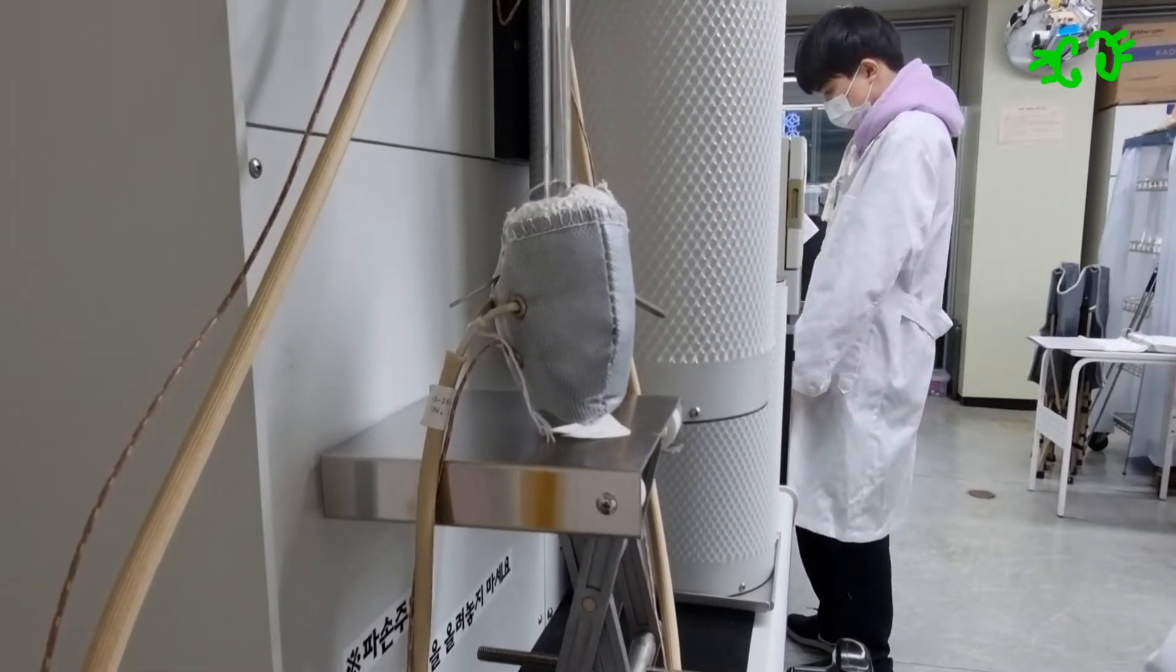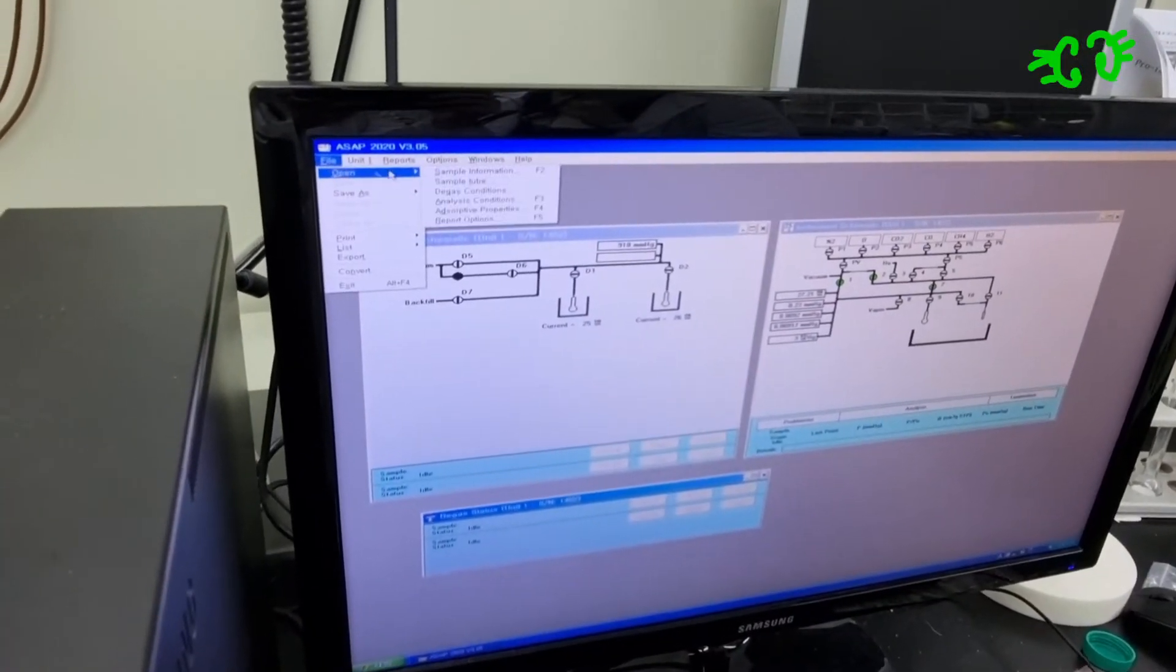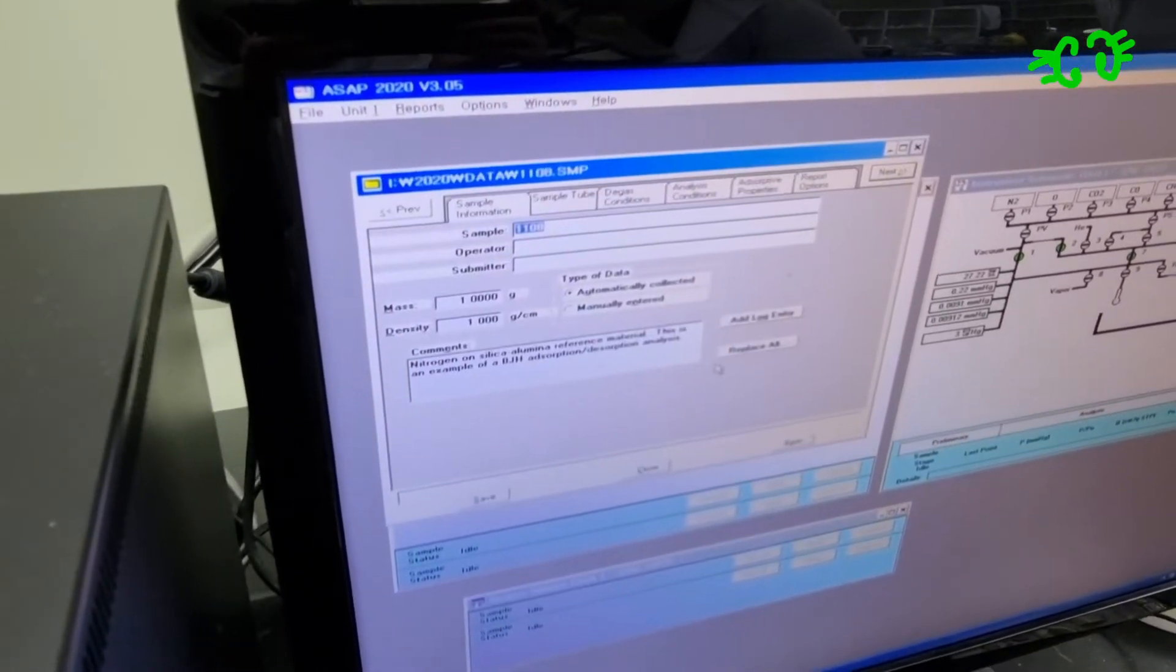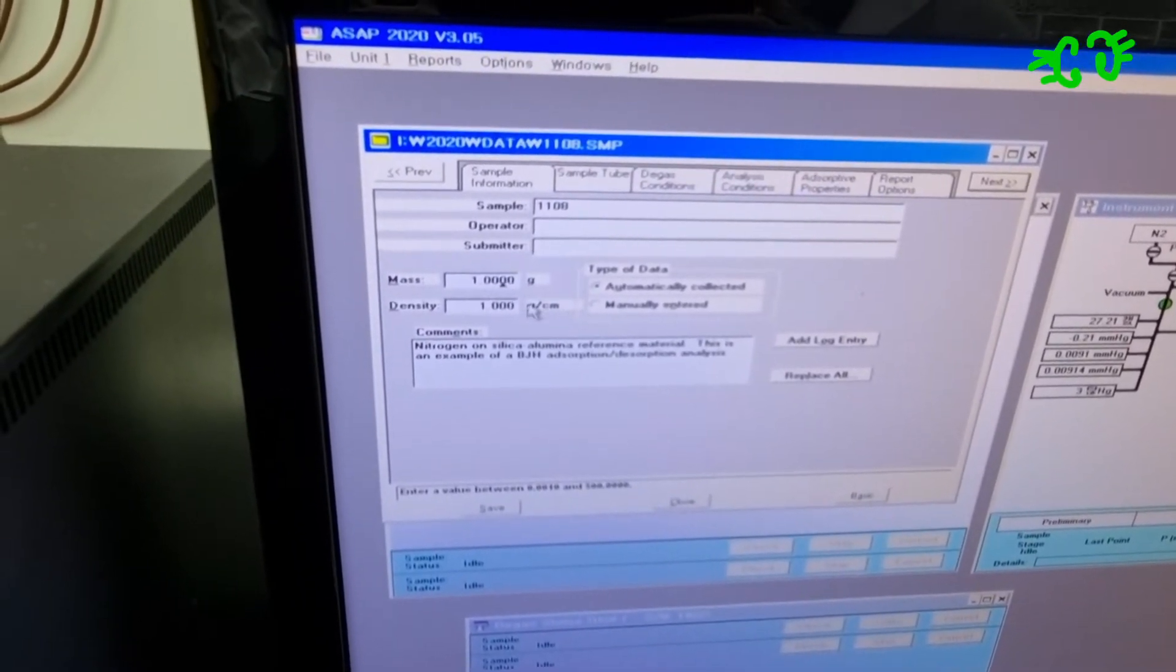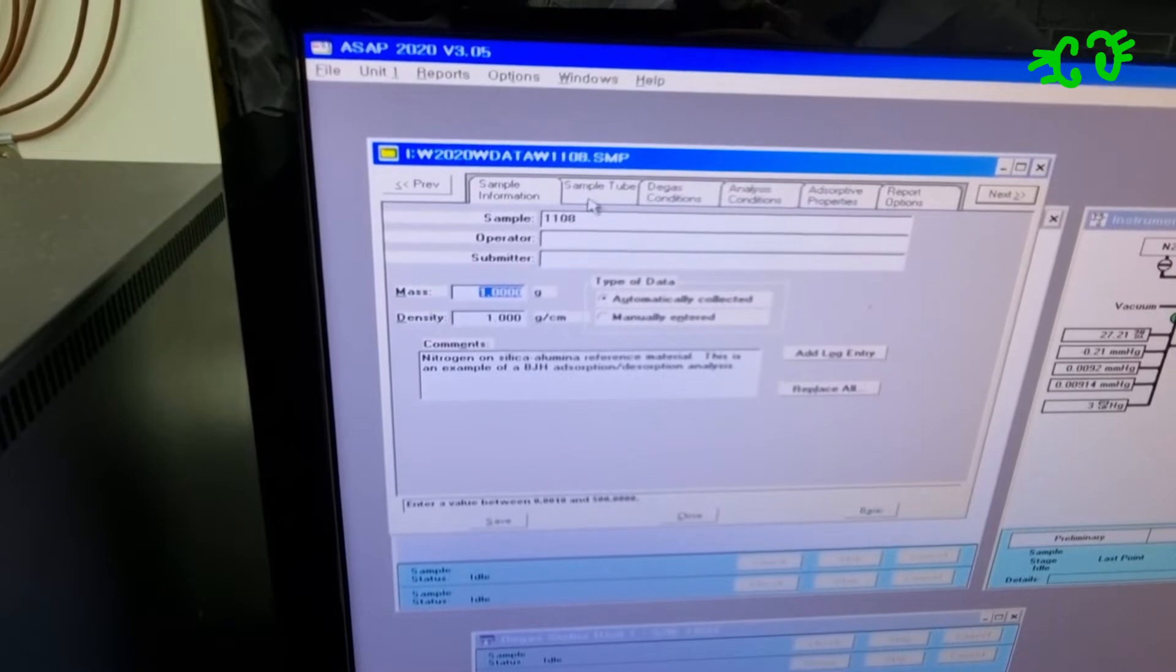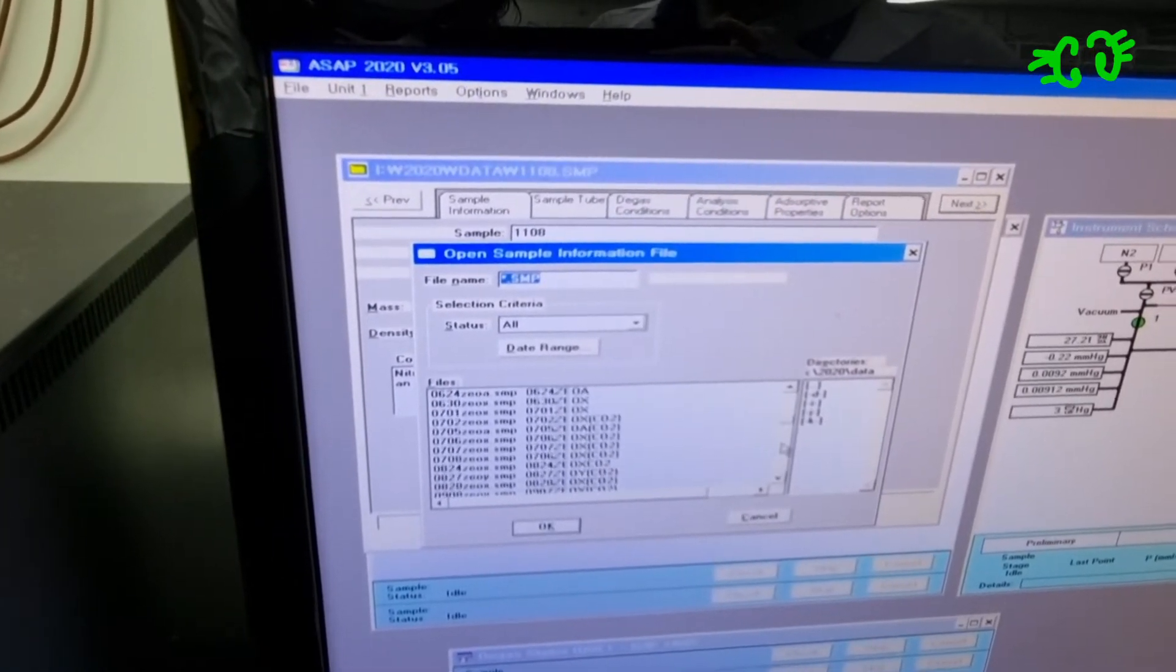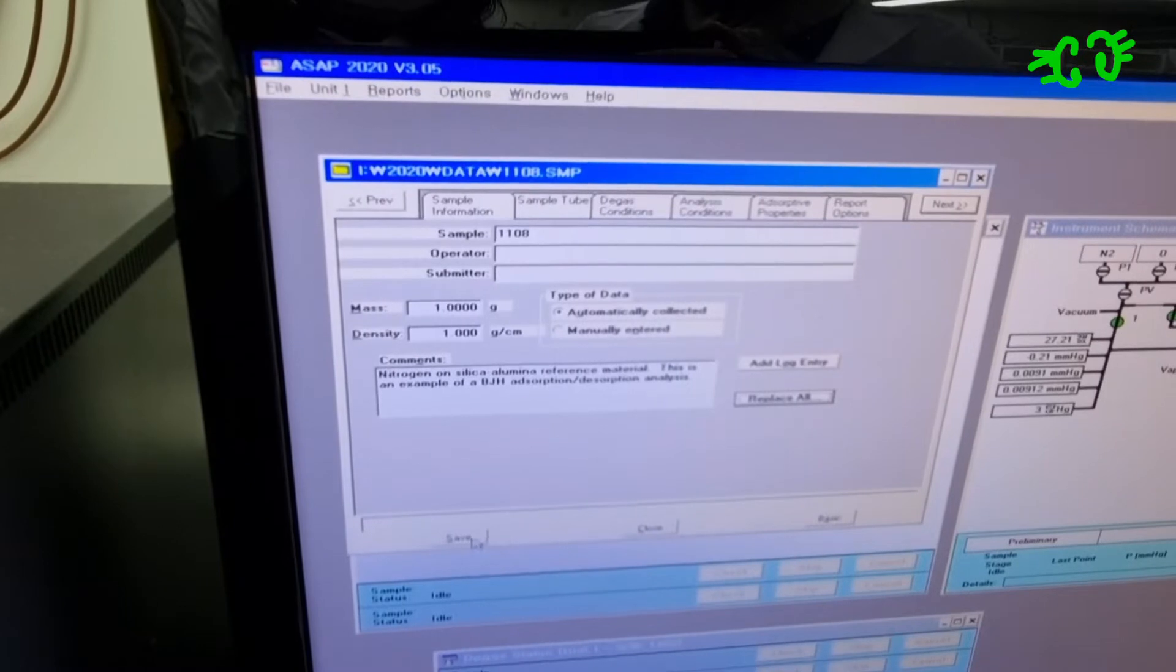You can make the file from here. Open sample information and we can input any name you want, then click OK. Here we should input the mass. We should measure the mass before the preparation and after the preparation. You can click here to put other conditions or information files and save it.